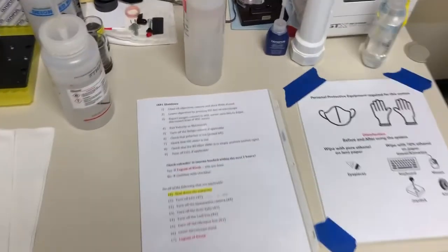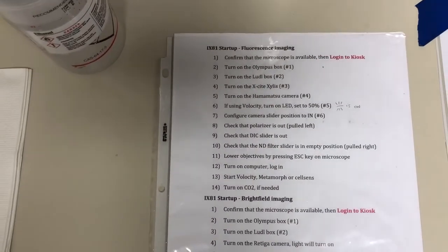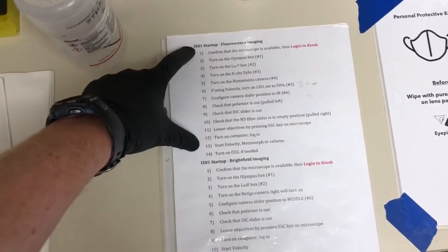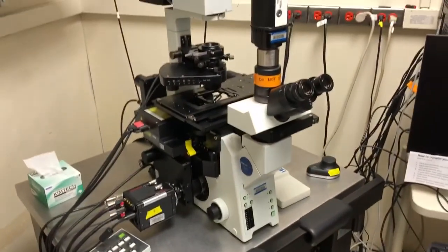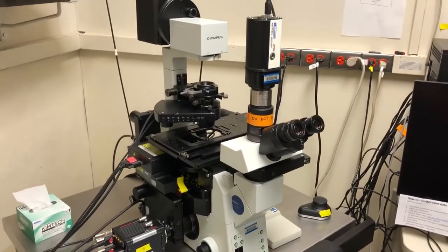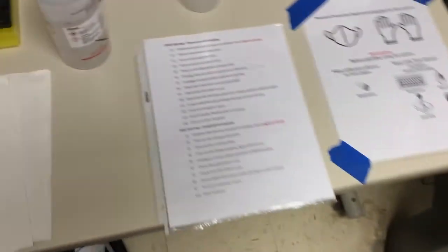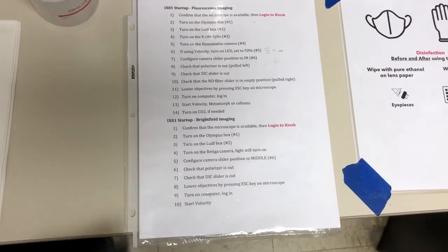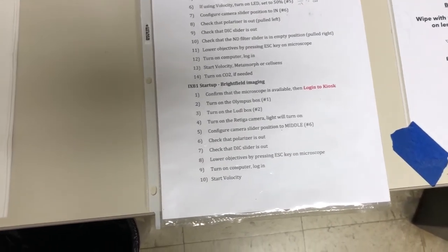You'll see on this table there's a sheet that has the shutdown instructions on one side and the startup instructions on the other. The startup instructions have two sections: for fluorescence imaging or for bright field imaging. If you find the system on, you should still look over those instructions to make sure that the components you need for your particular kind of imaging are on. Right now the system is off, so we will go through the instructions for bright field imaging.